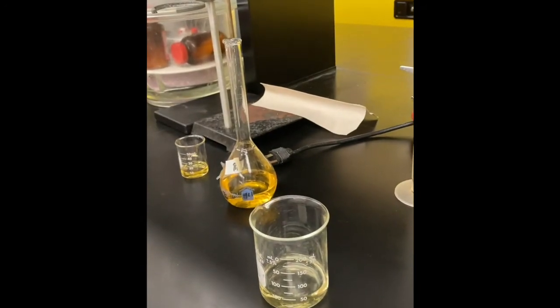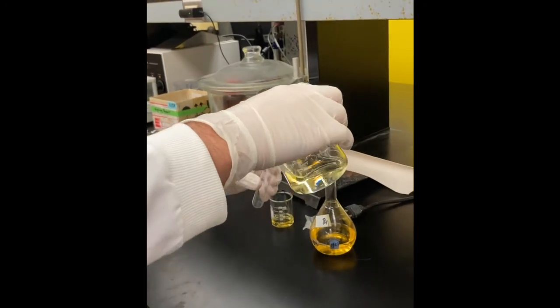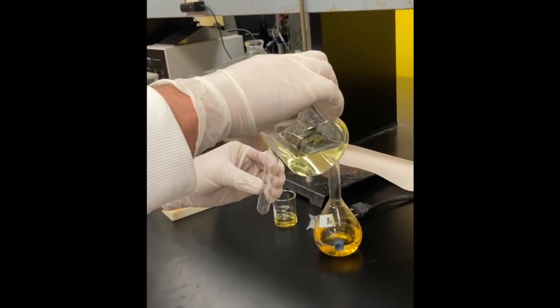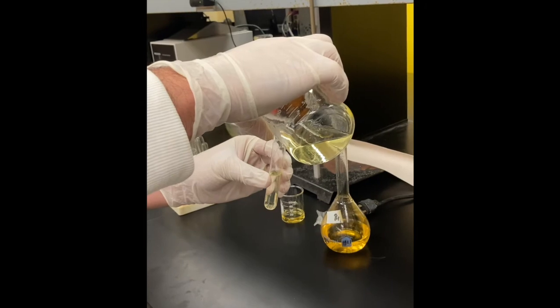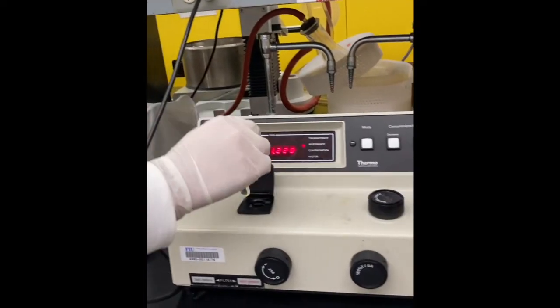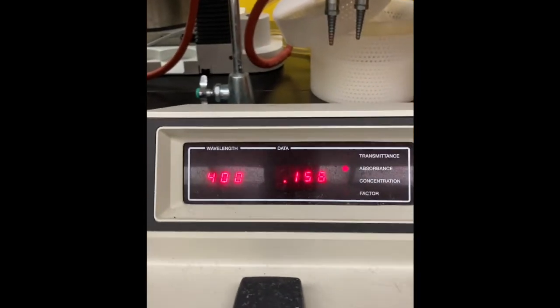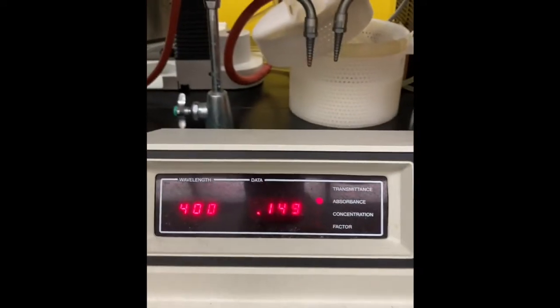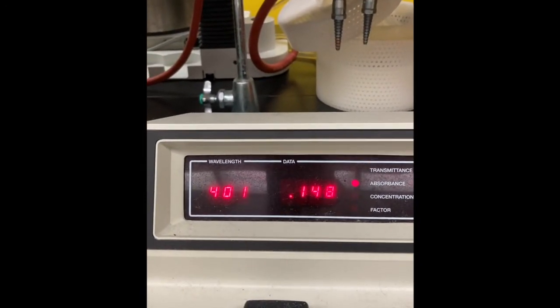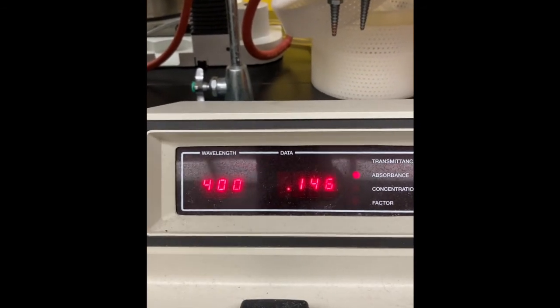Now our solution is ready, and we need to quickly transfer it into the cuvette because the bromination of acetone reaction starts immediately after the mixture is made. And now we can start the timer, write down the first absorbance, and take measurements every 30 seconds.